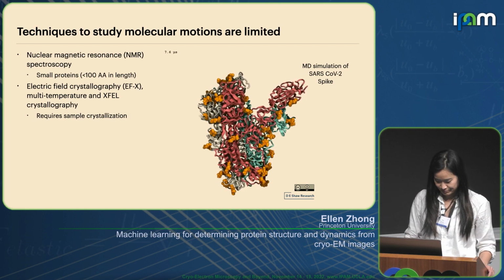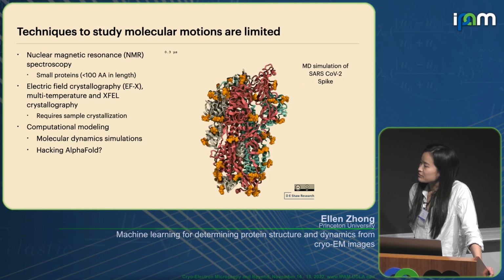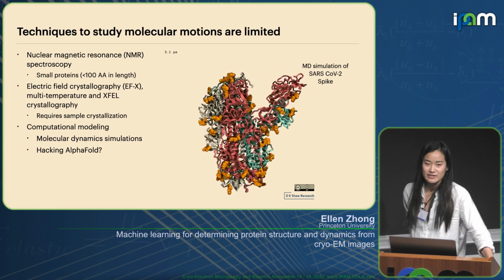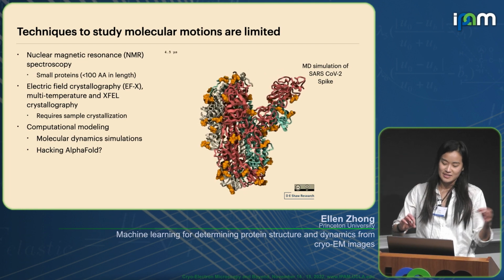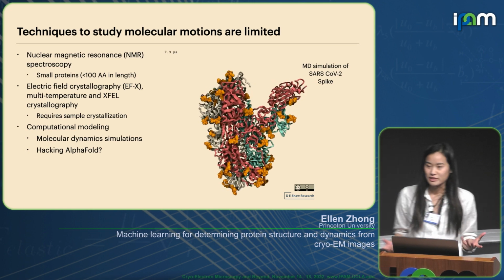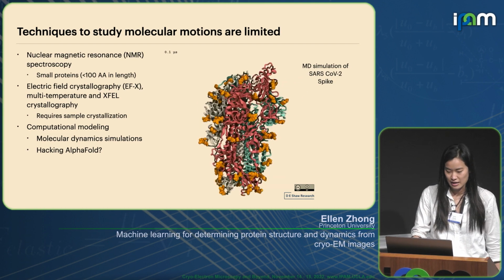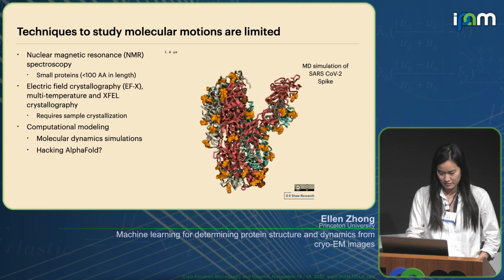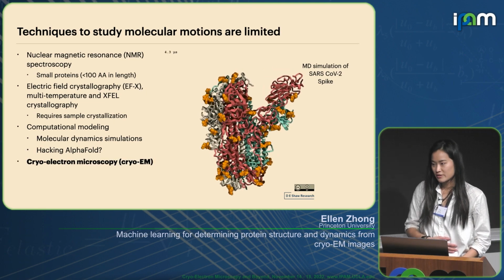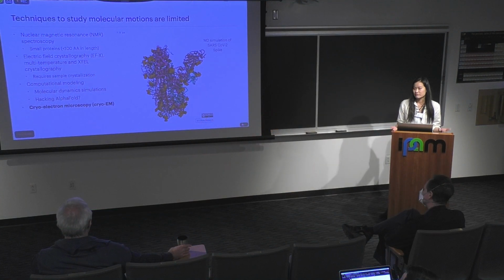My previous background was in molecular dynamics simulations. What we see here on the right is an MD simulation of the SARS-CoV-2 spike protein, and while this gives you a very precise in silico microscope at what might be happening in these systems, this is ultimately just a simulation, so you'll still need experimental data to validate what's going on in terms of the dynamics of these molecules, which is why I've been very excited about the opportunity for cryo-EM in uncovering molecular motions directly from experimental data.